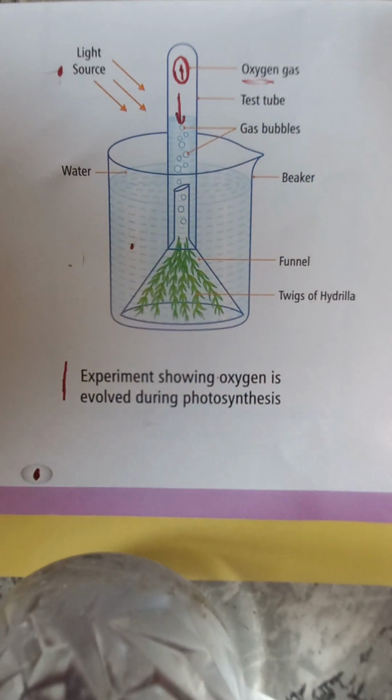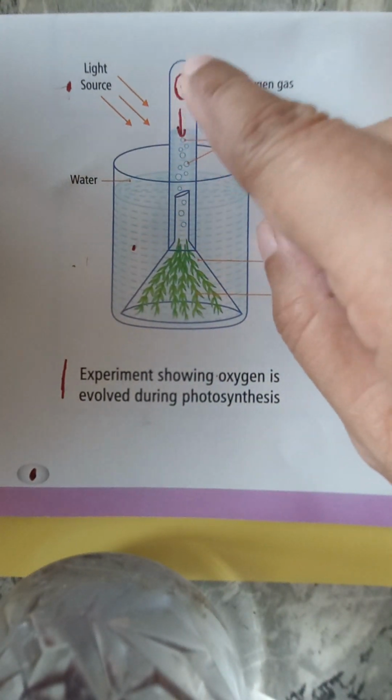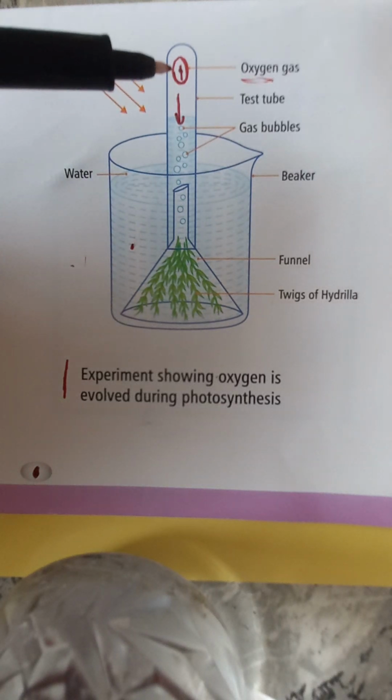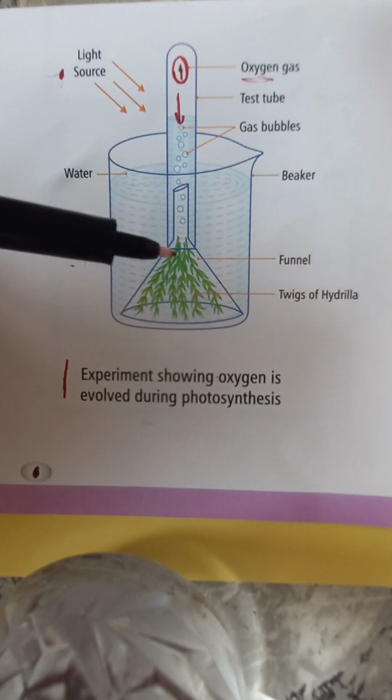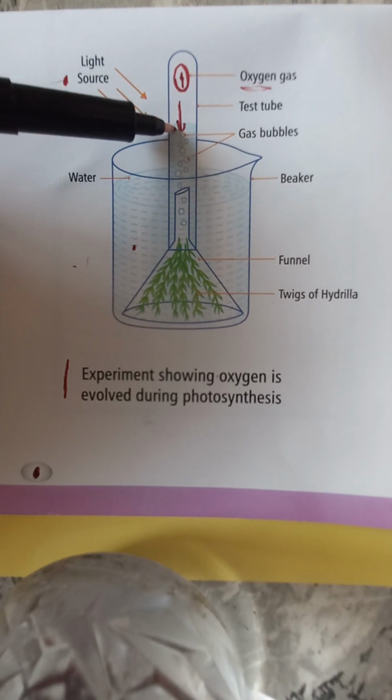So what you will notice after an hour, that small bubbles are being produced steadily from the cut end of the hydrilla plant or twigs of hydrilla, and you will see that the water level has gone down.